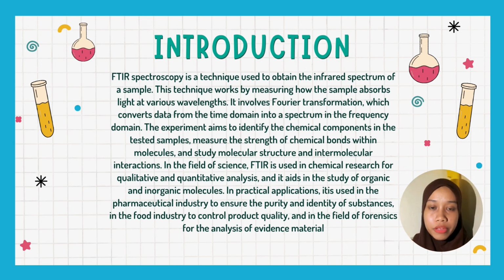Next, Fourier transform infrared (FTIR) spectroscopy. The introduction: FTIR spectroscopy is a technique used to obtain the infrared spectrum of a sample. This technique works by measuring how the sample absorbs light at various wavelengths. It involves a Fourier transformation, which converts data from the time domain into a spectrum in the frequency domain.